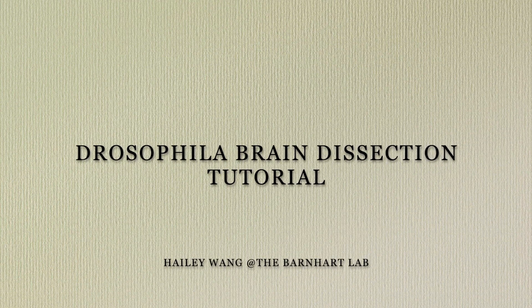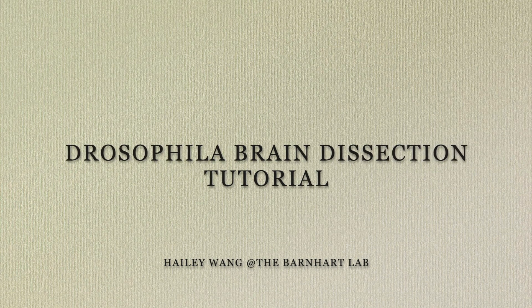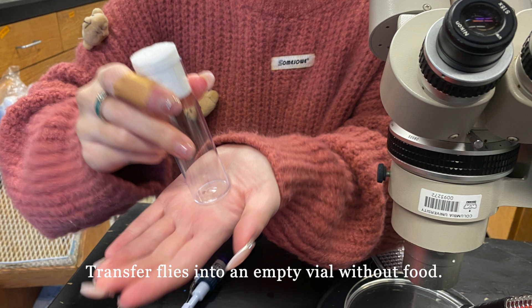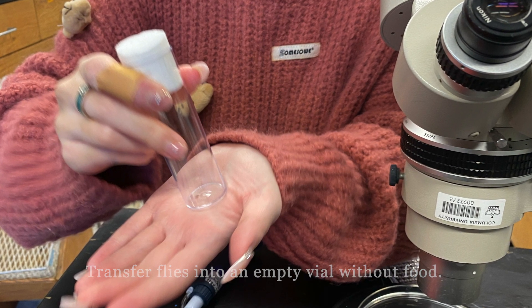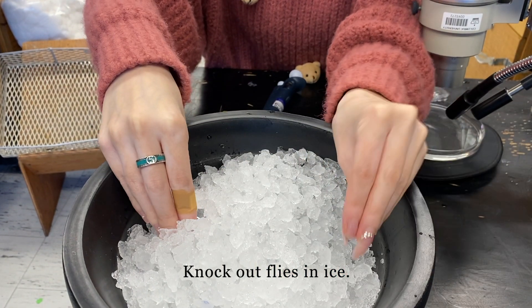Welcome to a brief tutorial of Drosophila brain dissection. First, we transfer the flies into an empty vial without food. Then, we knock out the flies by covering the vial with ice.